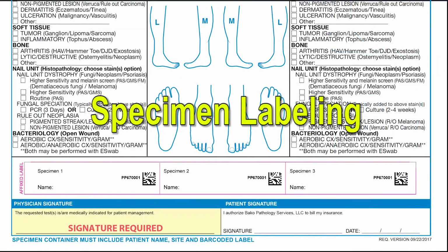Specimen labeling. The Bako requisition provides 3 labels. You are not required to use the Bako label, but we strongly encourage its use. The Bako label provides one form of ID by providing a 2D barcode that ties the label to the requisition. This feature can prove invaluable in situations where a discrepancy is suspected or detected.